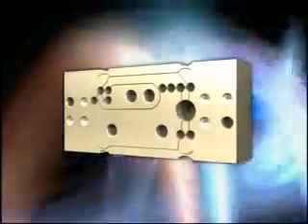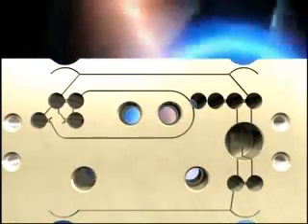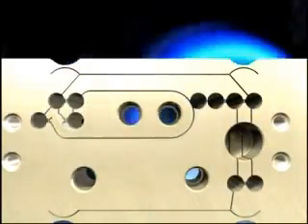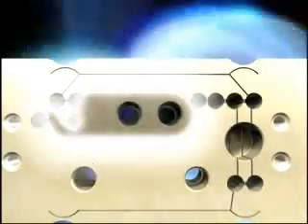All the workings of this high-precision electromagnetic balance have been machined into this single, compact block. UniBlock is a successful result of using a special technology called high-precision electric discharge processing, with a precision of plus-minus several microns, in a process that finely cuts a block of aluminum down to less than 100 microns, while suppressing the generation of residual stress. This compact body uses a two-stage design, where when a load is applied, two levers move in tandem. The movement generates an electromagnetic force, returning the second lever to its original position.